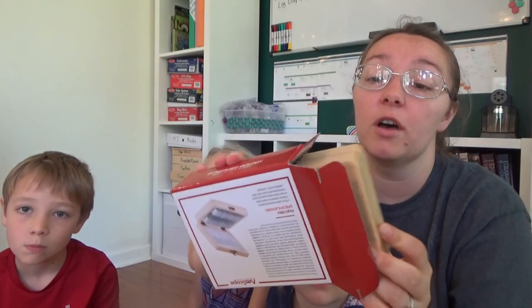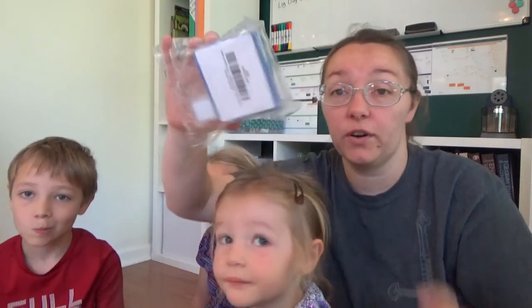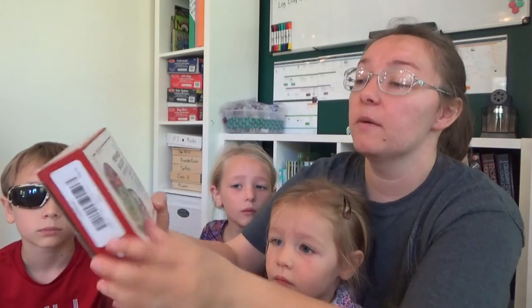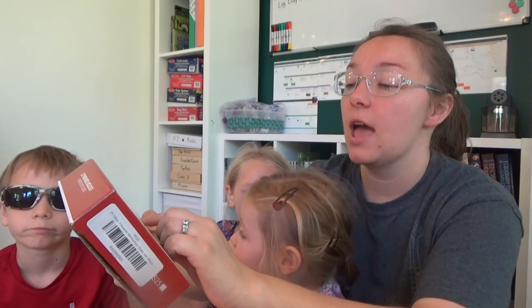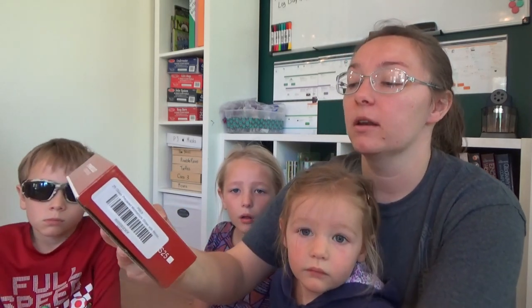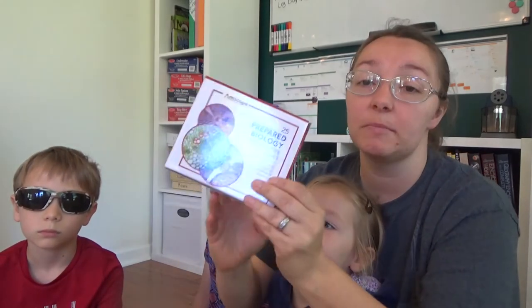That was one of the things we bought, along with empty microscope slides for us to make our own samples and specimens. Then we bought the prepared ones. On the box it says etymology, mammalogy, hematology, mycology, anatomy, and botany — so there are all kinds of slides depending on what science unit you're doing, or you can just let your kids look at them for fun.